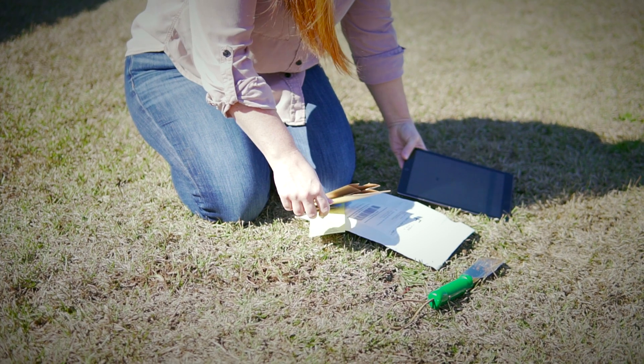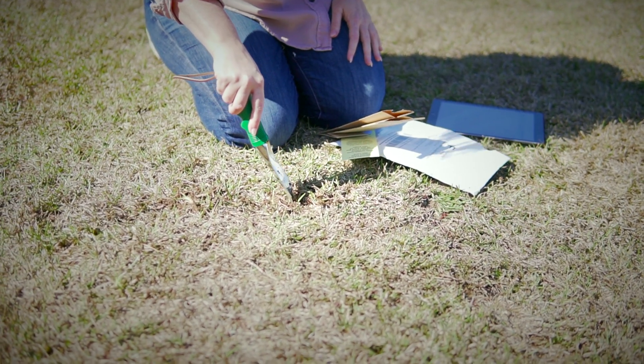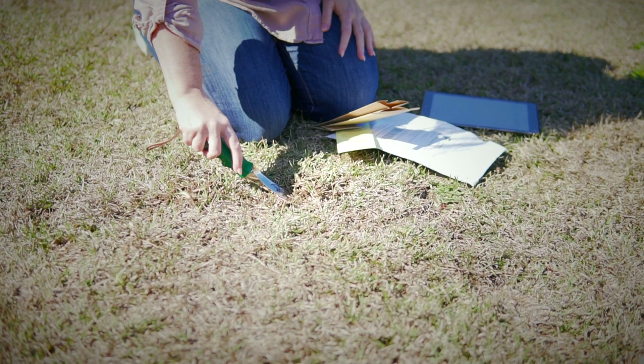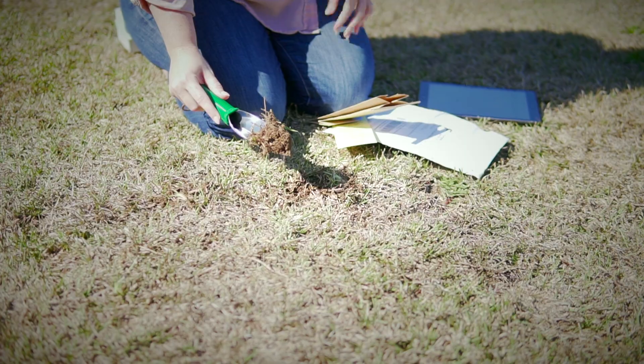Now it's time to take your soil sample. Be sure to use a stainless steel or plastic trowel to avoid metal contamination. If your soil has been recently fertilized, you'll need to wait two weeks before sampling.